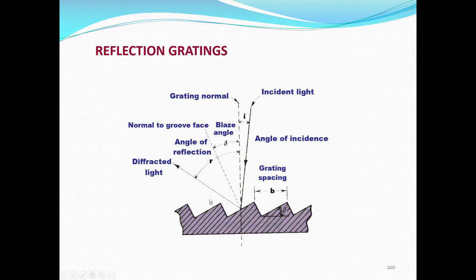So, basically whenever the radiation falls, you see that it is as if a number of prisms are employed in choosing the wavelength. So, this is the optics of the grating, and here there is a grating normal, and then the incident radiation is falling like this, it goes out like this, and then it gets diffracted on the other side. So, this is the reflection, this is diffraction.